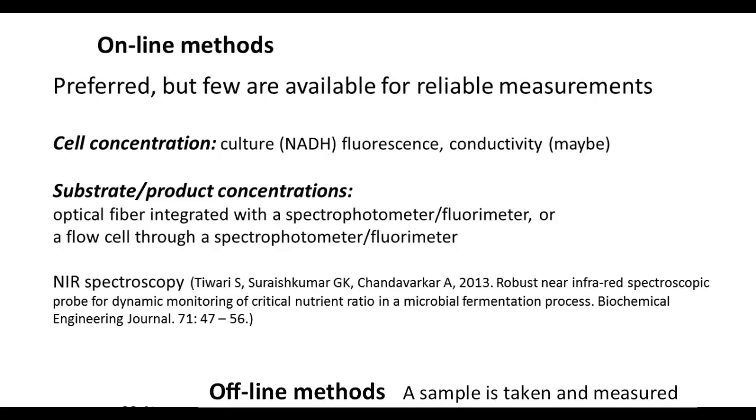The advantage here, let me talk of this specific case so that you will understand. This industry was looking at using low levels of substrate because the substrate was toxic to the cells for their own commercial product. So the substrate needs to be maintained at a certain low concentration, of the order of about 2.5 to 5 millimolar. The substrate concentration needs to be kept at a low level, and also the product concentration needs to be maintained at a certain level, otherwise it would become toxic.